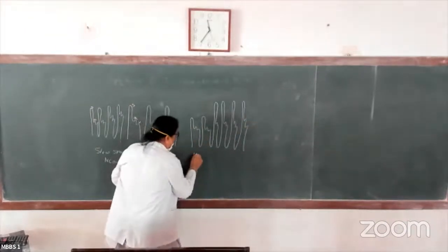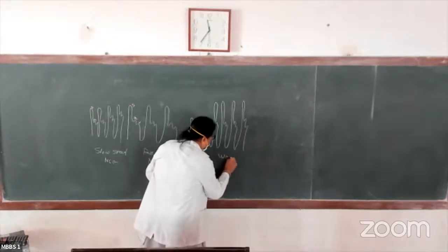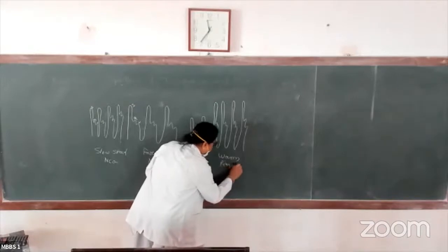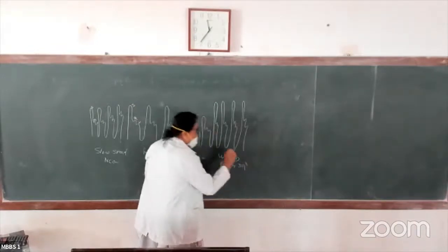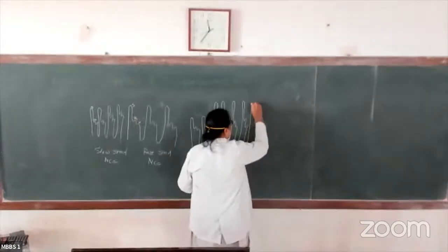So this is normal, and this is the warm ringer solution. Increased force of contraction, increased rate of contraction.